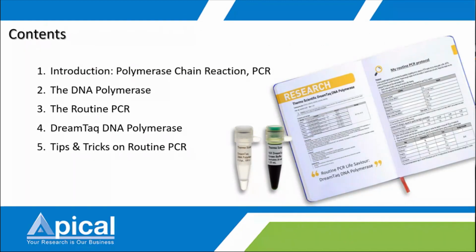In this webinar, I will start with a short introduction on PCR. Then we will talk about the function of DNA polymerase and Taq DNA polymerase in PCR. Then after that, we will go into more detail on the routine PCR application. And I will share with you how DreamTaq can help you in your routine PCR work. And last, I will share with you some tips and tricks for your routine PCR.